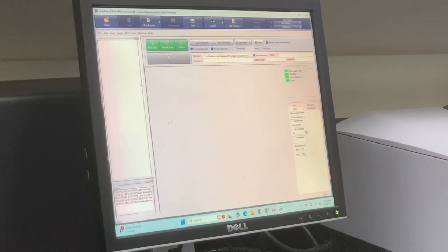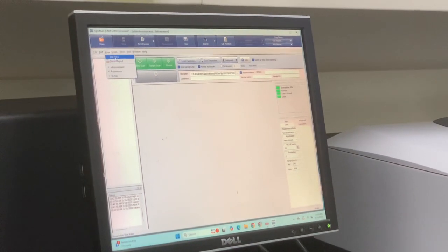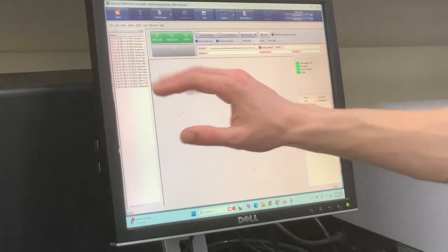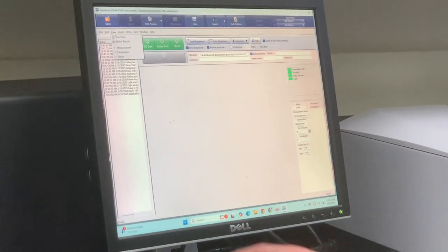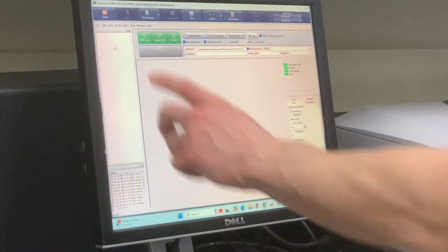So you can move the windows when you click a double arrow, little stuff like that. Alright, so here we go. Right now there's no tree view. This is the measurement area, not measurement, sorry, the status report being expanded to fill this whole area. So be aware of that. So the tree view is where your files will go.